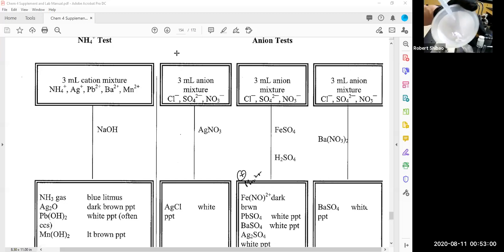The first wash I'm going to collect in the test tube. And so that's my first wash. So I'm washing off the crystals, and I'm going to collect that here because that's going to be wet with filtrate. The second wash isn't going to be so much. This is kind of slow. Okay, there it goes. Now the second and the third wash, I'm going to need one more beaker. Back here.